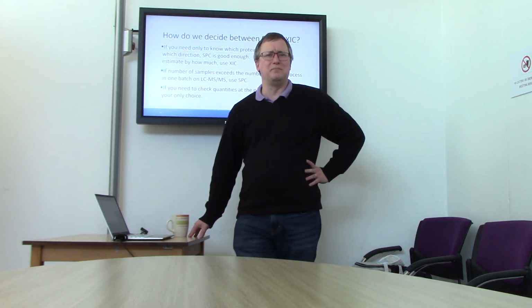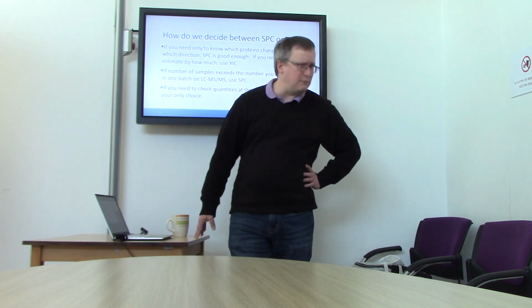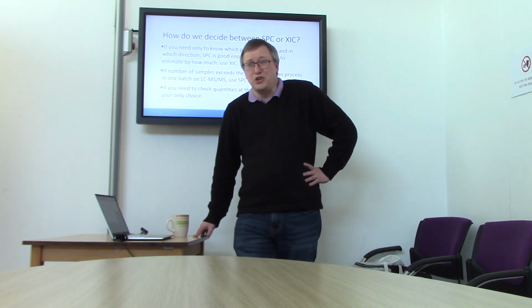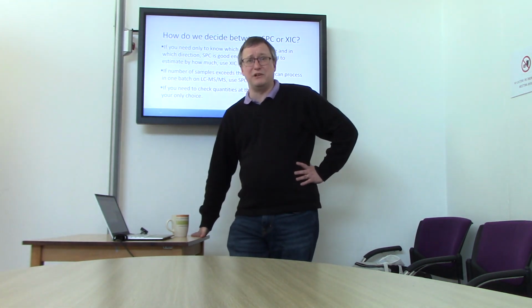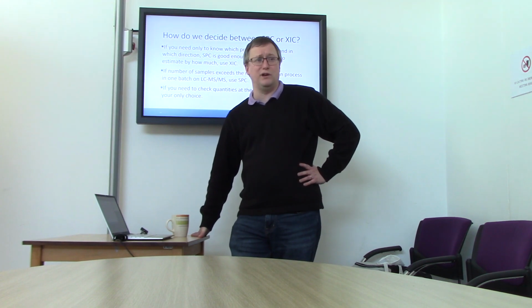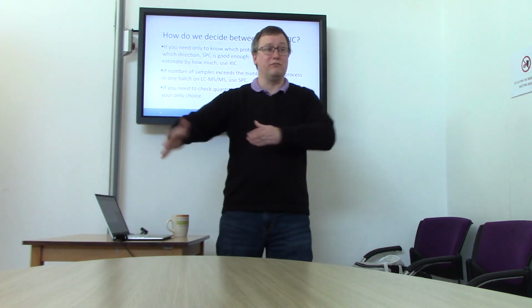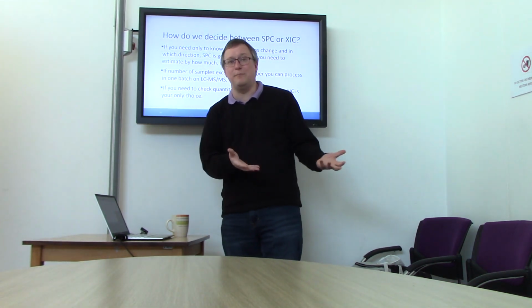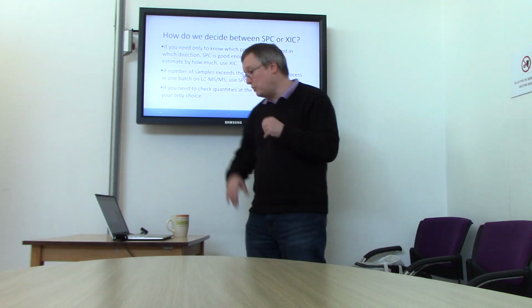So how do I decide whether the same raw files, the same LC-MS experiments, can be used in a spectral count analysis, or they can be used in an XIC analysis? So how do I choose? Which way should I go? This is honestly a question that a lot of experienced people in our field have difficulty deciding. Largely, you'll find that people have great familiarity with a software workflow that relies on XIC, and so they assume I should use XIC. Some people really trust spectral counting, and they use that all the time. So a lot of this is going to rely on familiarity, but there are some reasons why you might opt for one rather than the other.